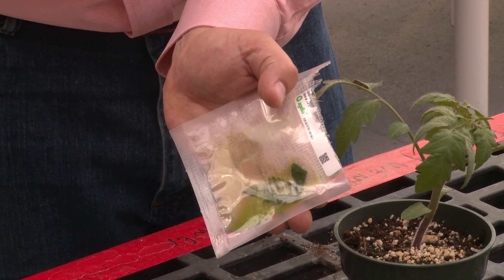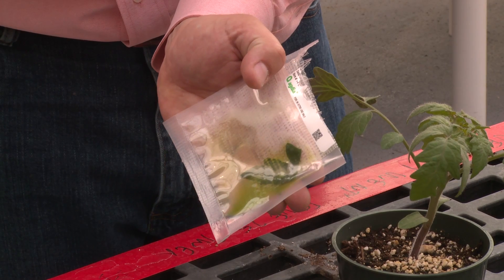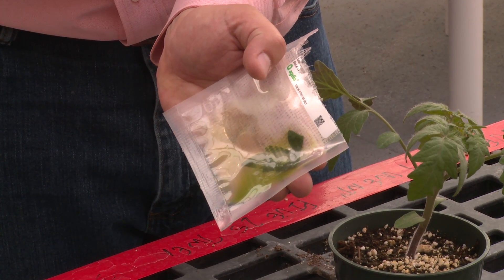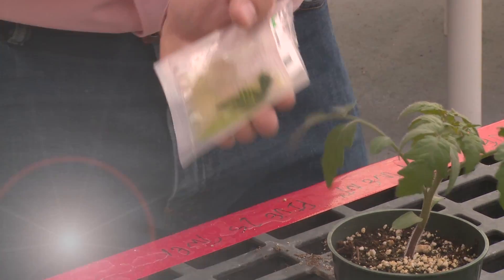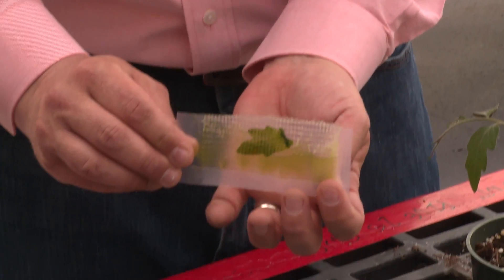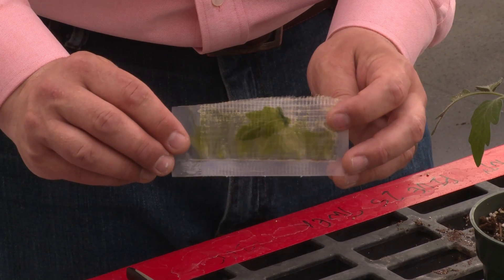Once you have thoroughly macerated the tissue, we want to let it sit inside of that buffer solution for about three minutes in order to let it mix with the buffer. I've already got a sample that I've let sit for three minutes, so let's go ahead and proceed with our strip kit test.